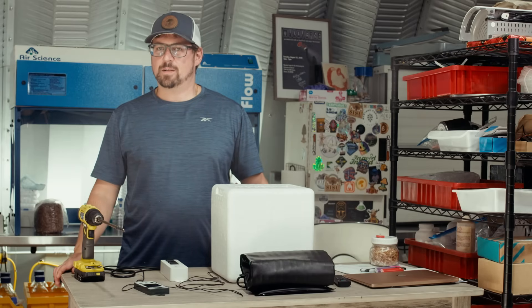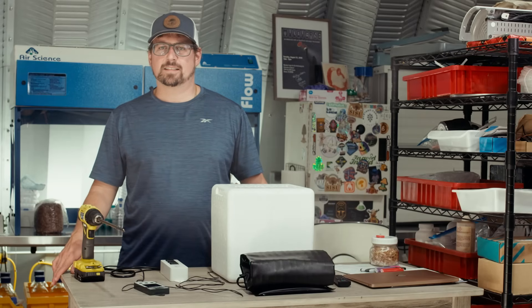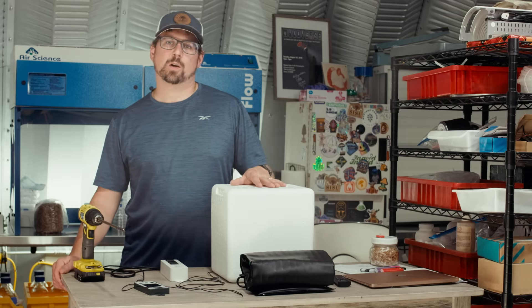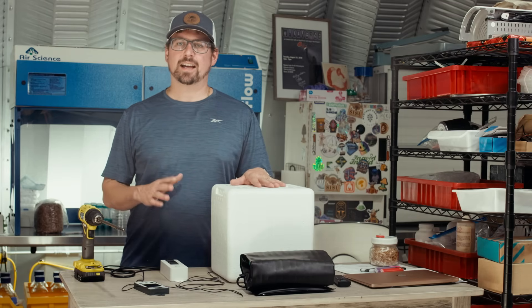What's up mushroom fam? It's Gary with Fresh from the Farm Fungi. Today I'm at my mushroom farm in Sedalia, Colorado, and I'm going to show you how to make a DIY incubator.